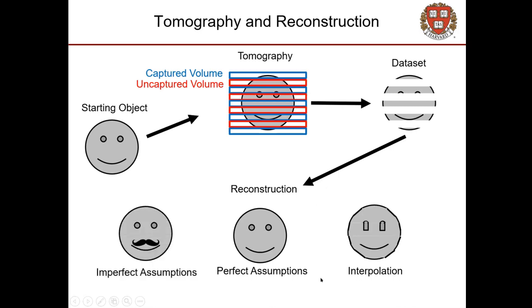In an imperfect world, of course, we are going to start introducing defects and artifacts when doing that. Atom Probe is going to take advantage during the reconstruction process of both prior assumptions and interpolation at various stages. But it's also quite a complicated procedure, and I'm not going to say too much more about it than this. Just know that it has to happen.